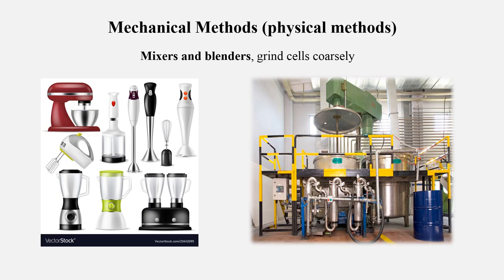سنقوم بعرض مجموعة من الصور لكل طريقة من طرق التحطيم لأخذ فكرة عن هذه الطرق ومعرفة هذه الأجهزة المستخدمة في طرق التحطيم. أولاً، استخدام الخلاطات التي تقوم بطحن الخلايا بشكل خشن.